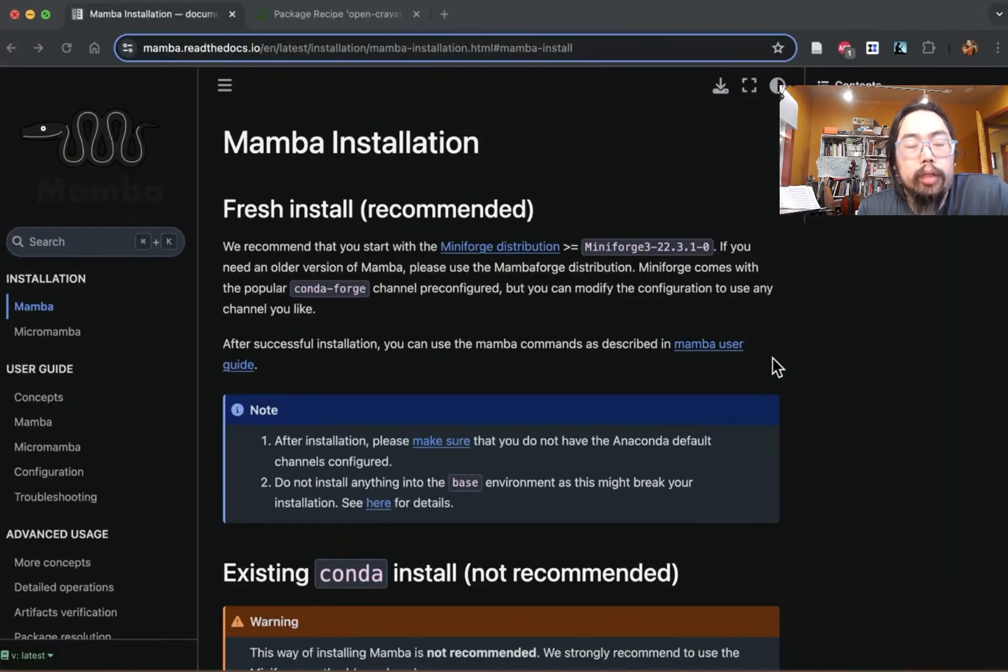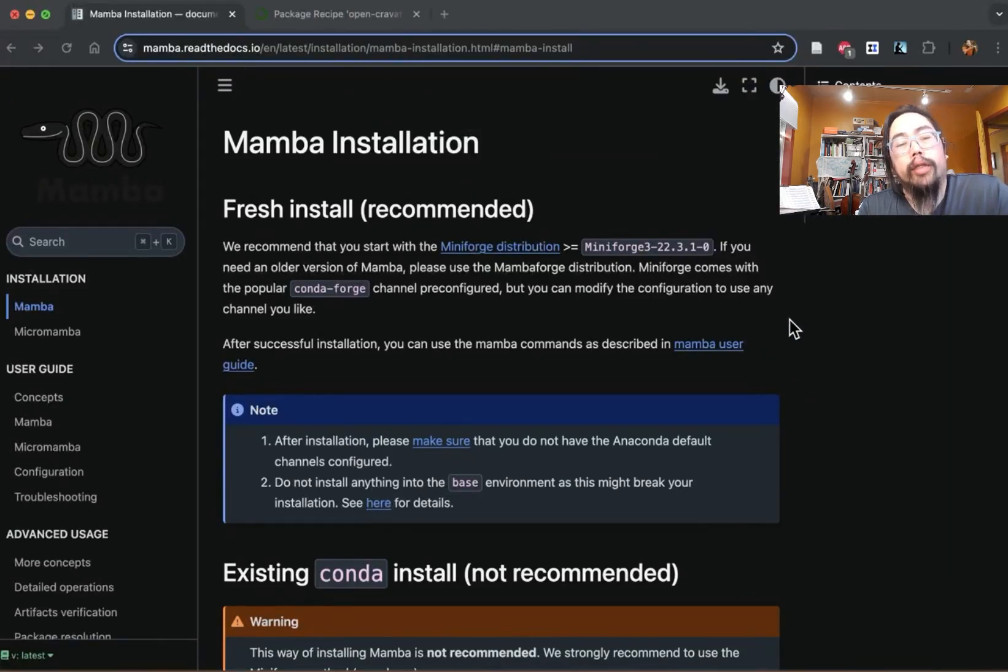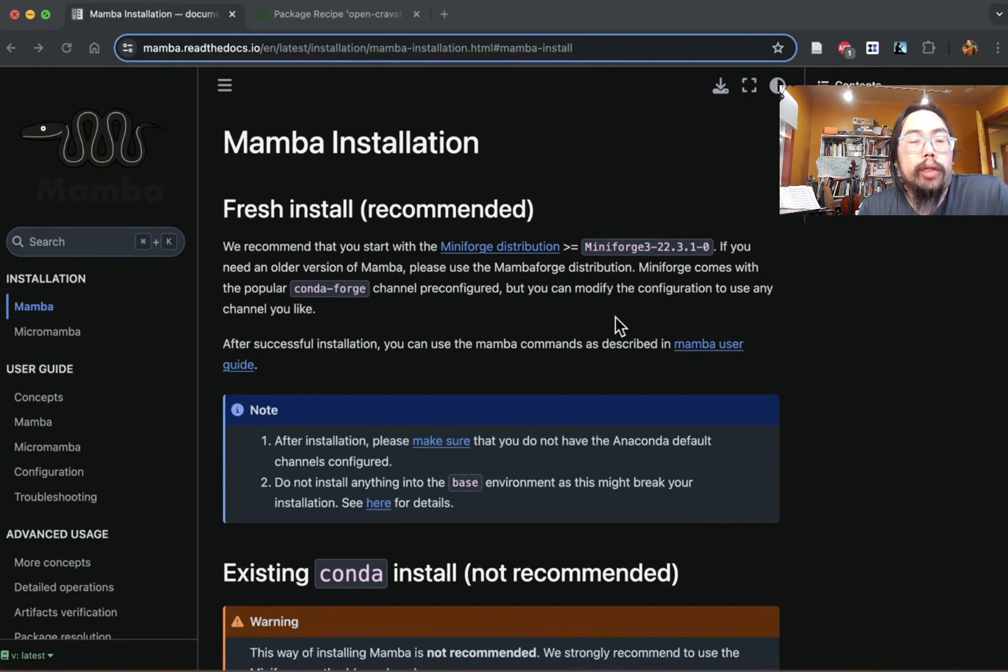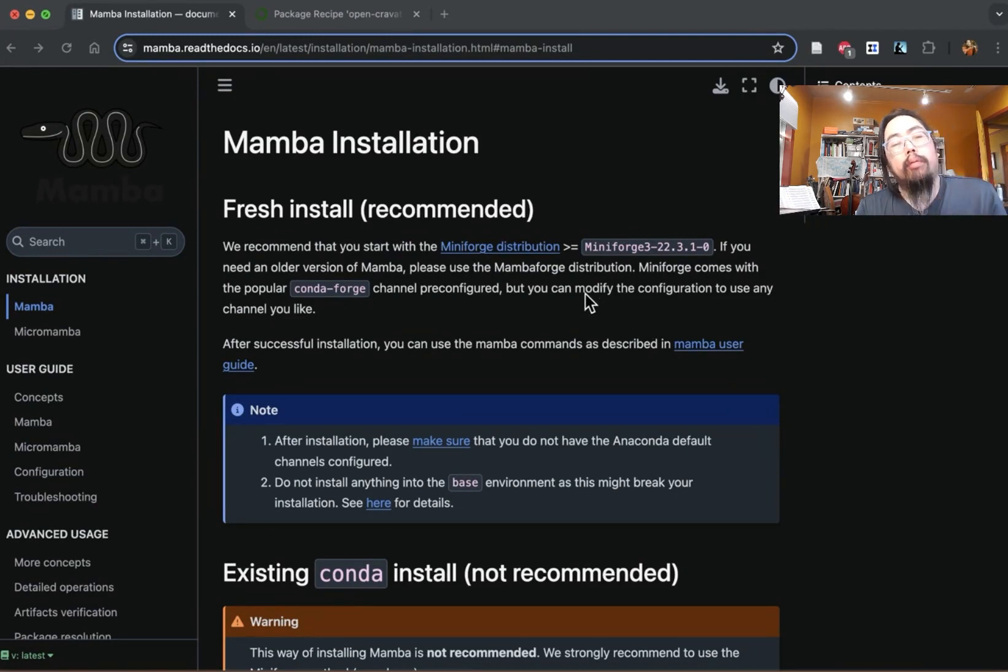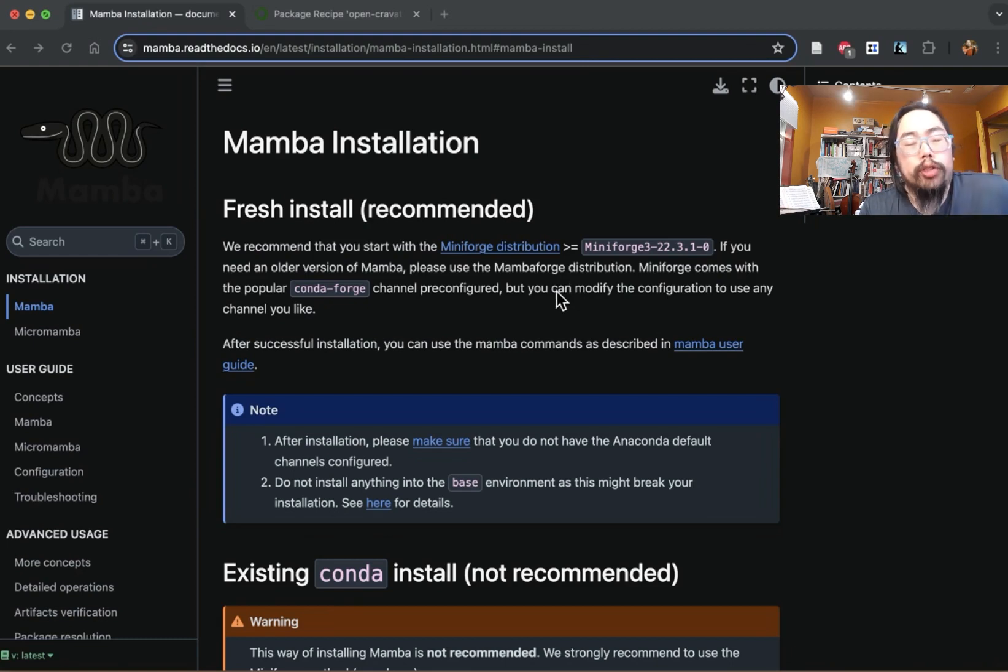Okay, let's talk about installing OpenCRAVAT via Conda. So the first thing you want to do is you want to install the Mamba program, which is kind of the updated version of Conda.